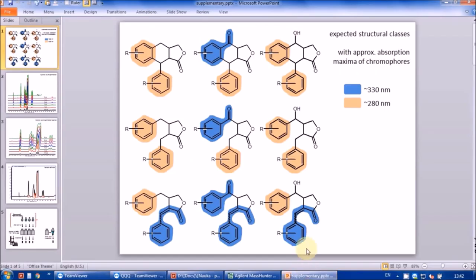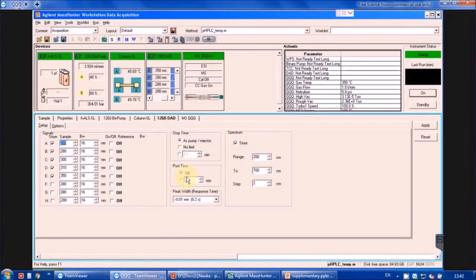Now, our compounds, or lignans, have absorption maxima at about 280 nanometers and about 330 nanometers. However, due to high concentrations, the detector would be overloaded at these wavelengths, resulting in a flat line at high absorbance. Instead, in addition to 280 nanometers, we will use several suboptimal wavelengths such as 300, 310 and 350 nanometers. This will allow the operator to estimate the elution profile of compounds with different concentrations and collect the fractions accordingly.